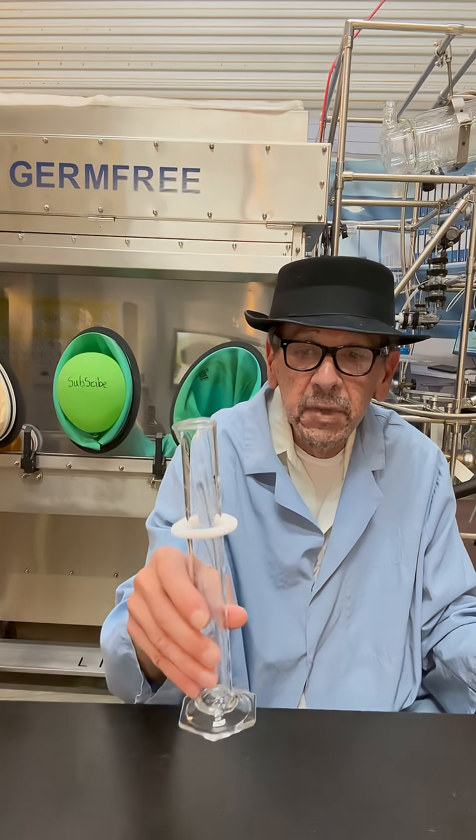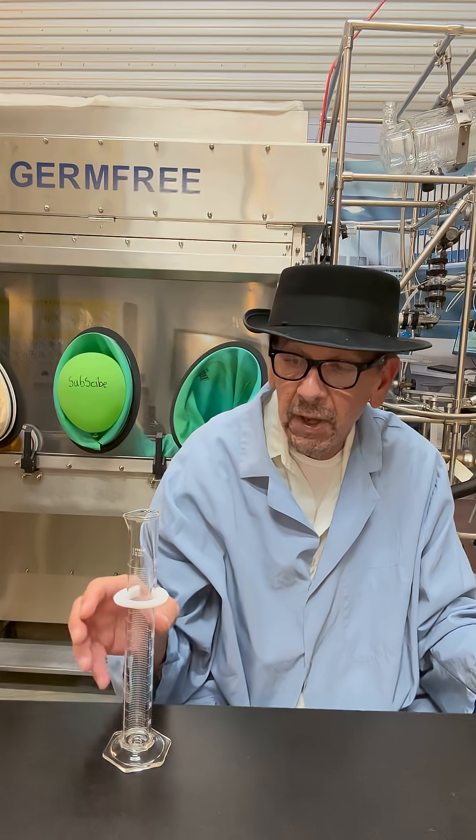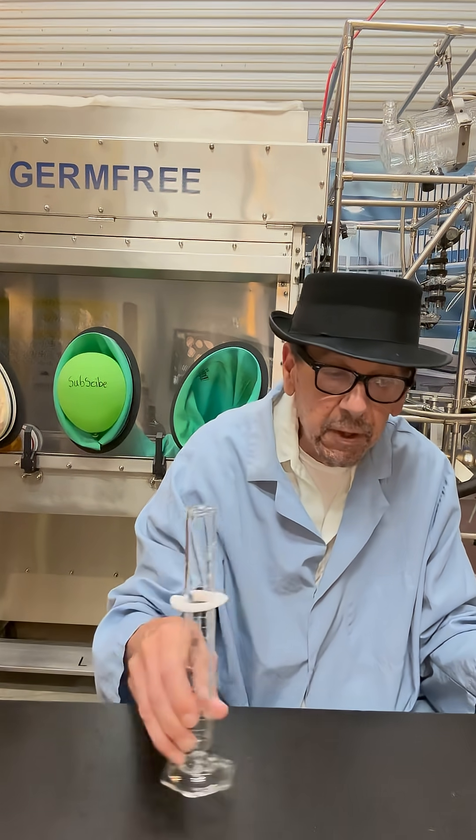This here is a 100 mil graduated cylinder with a collar that keeps it from breaking if it falls.